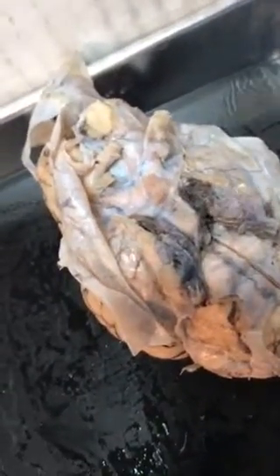CN4, the trochlear. This will be the trochlear, and I've dug through here quite a bit, and I have not been able to find CN5 or CN6. And I know they're here. I just haven't been able to locate them on this sample.